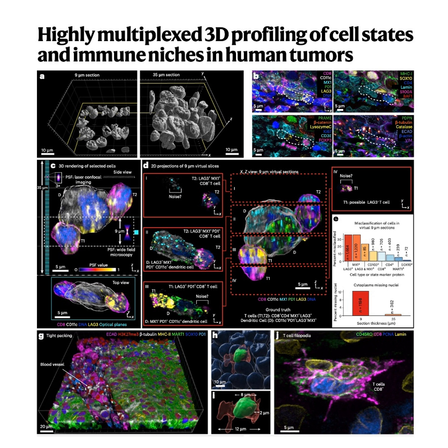This allows it to capture incredibly sharp images from just one very thin focal plane within the thick specimen. Then, the microscope moves its focus slightly deeper, takes another sharp image, moves again, takes another. It essentially creates hundreds of these digital optical slices throughout the entire depth of the thick specimen. I see. So you're not physically slicing anymore, you're optically slicing with light and computation, and then you stack all those digital slices back together. Exactly. You computationally reconstruct the full 3D volume from all those thin optical planes.